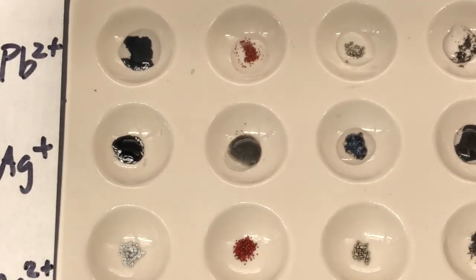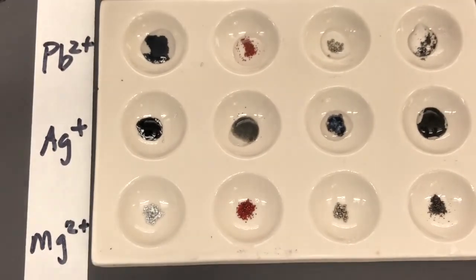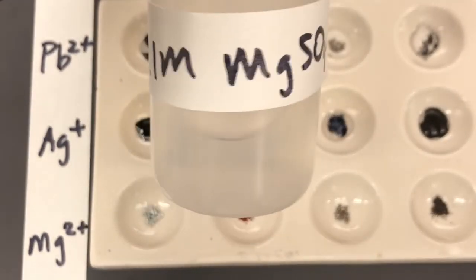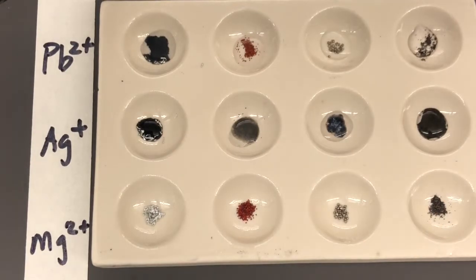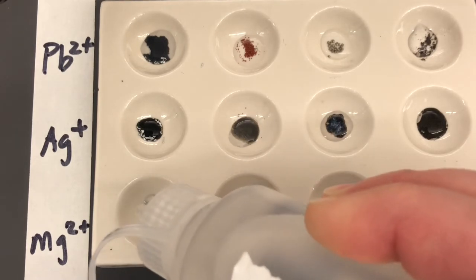We'll now move on to our last cation. Our last cation is going to be magnesium. So we're going to find some magnesium sulfate, 0.1 molar. Magnesium is a 2+. I'm going to add about 2 drops to each of these setups.